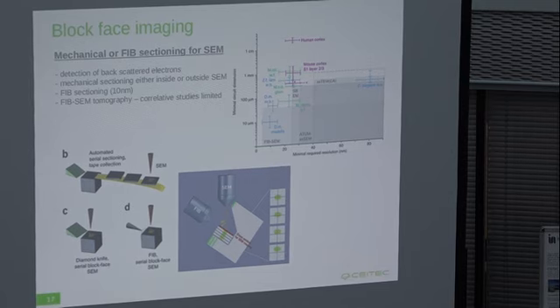In a scanning electron microscope, nowadays, with the recent technologies, we primarily use backscattered electrons, because the optics of the scanning electron microscope has improved, and now we have immersion lenses which can boost the amount of electrons that are dragged back into the electron column.